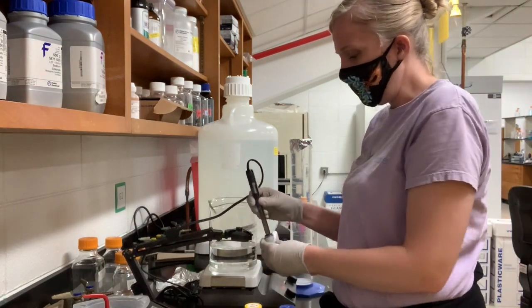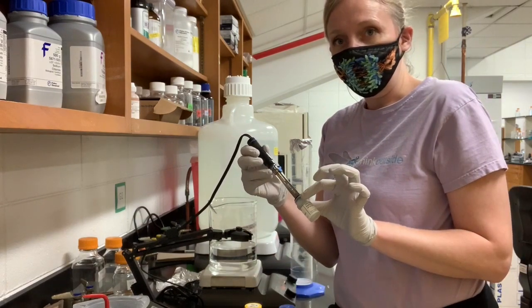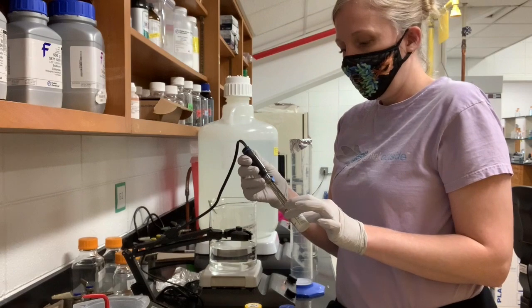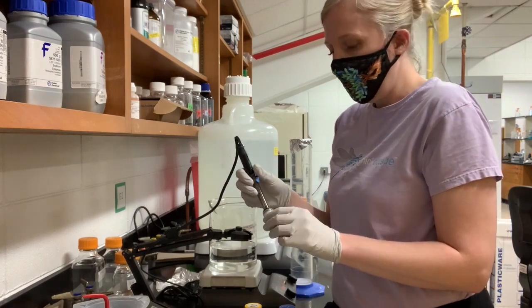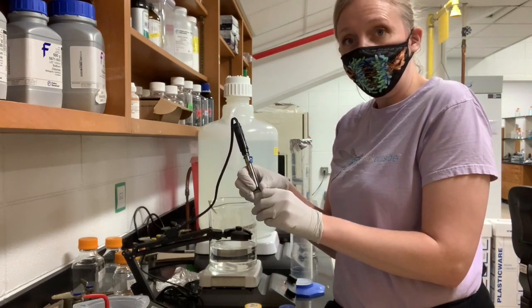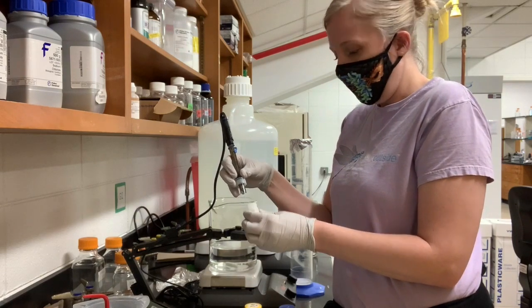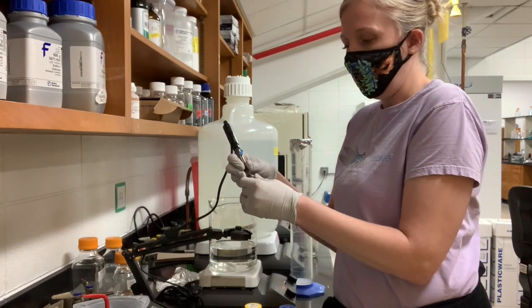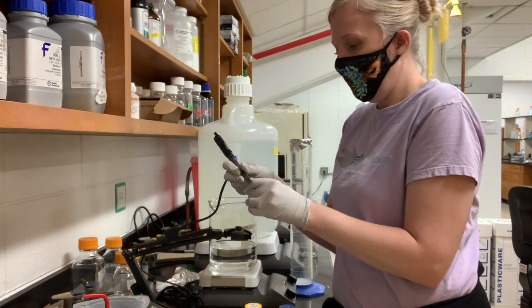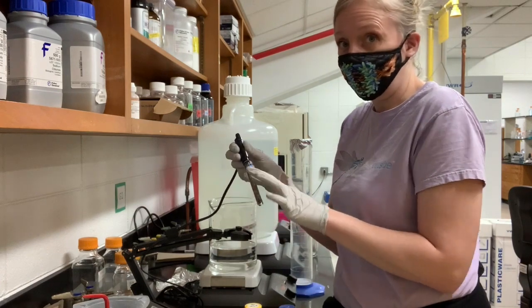So you'll see that there's a pH probe, and it will have a little bottle on the end of it. This is a little storage solution that keeps the probe in good working order. It's very tight, and so when you want to remove this bottle from the probe, what I would actually do is unscrew the bottle, carefully sit it on the counter, and then gently wiggle this lid off of the probe. I will say we have a plastic probe in the lab, but some of them are glass. We had a glass one that's broken, so just be careful, they're very fragile.